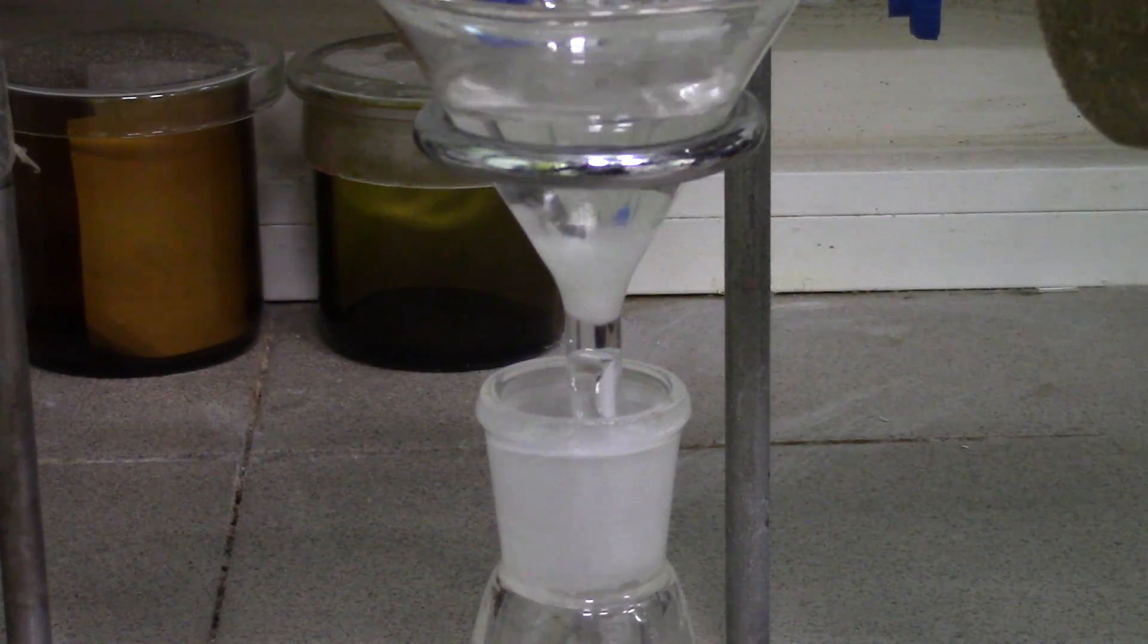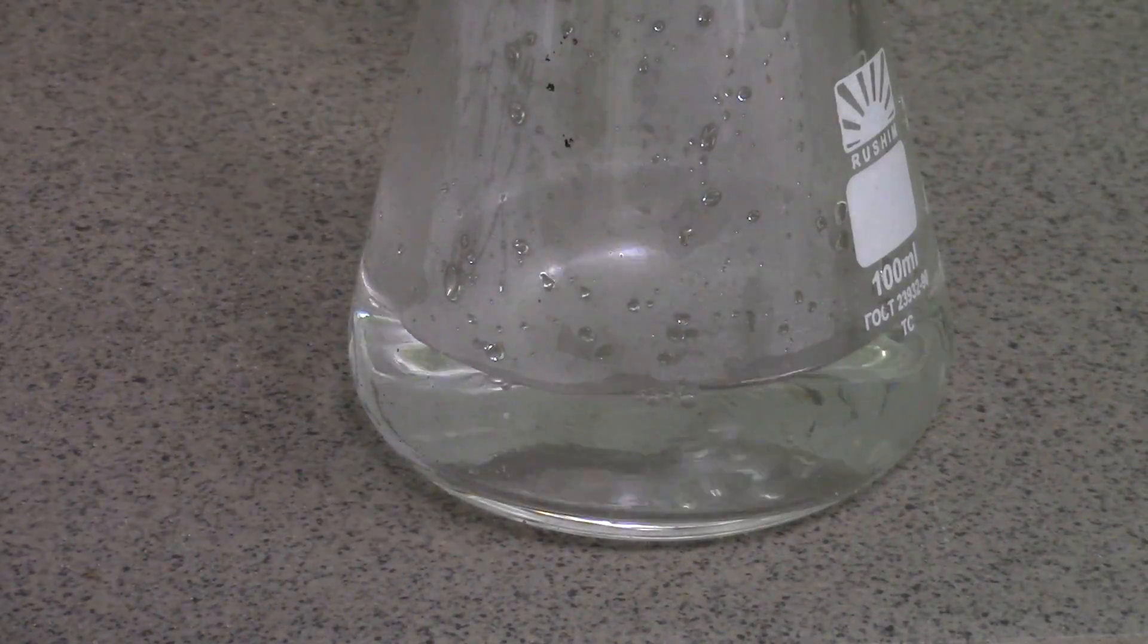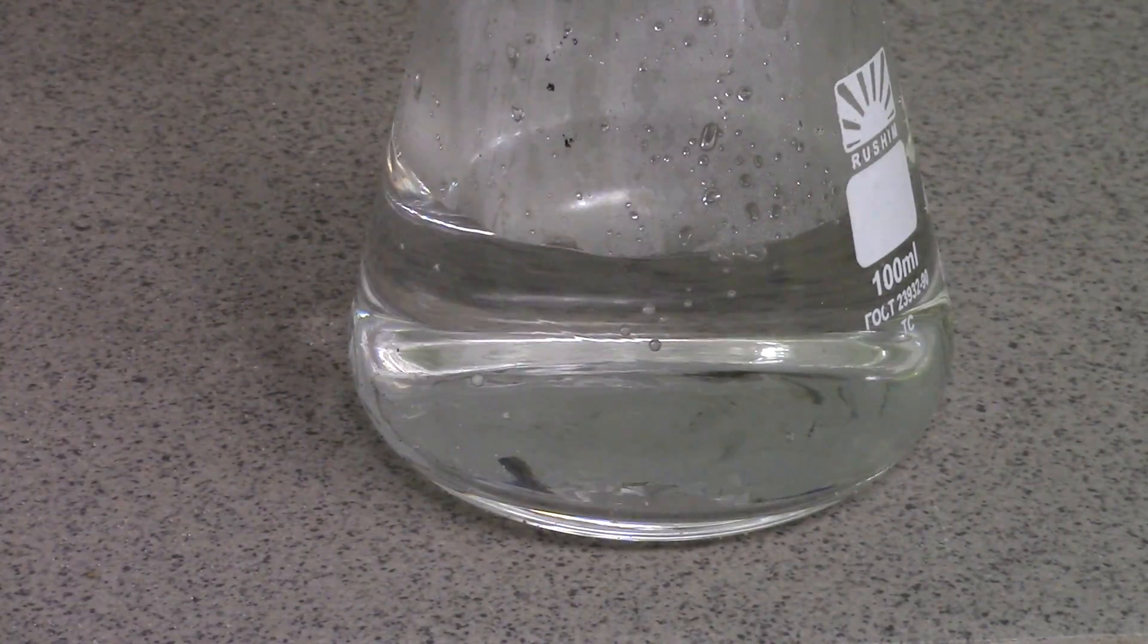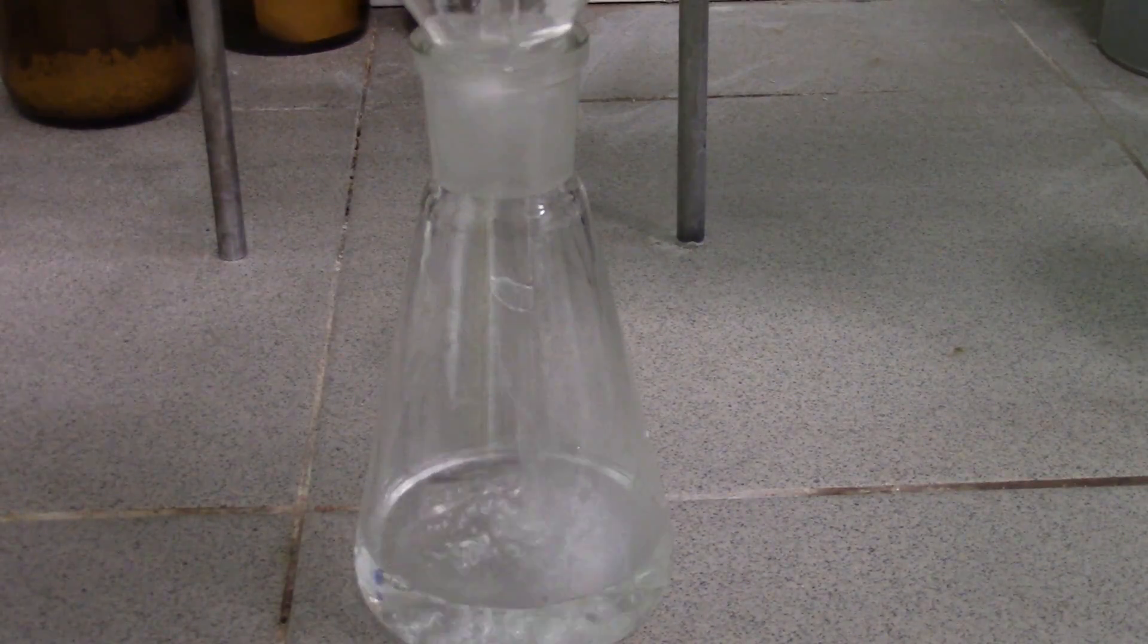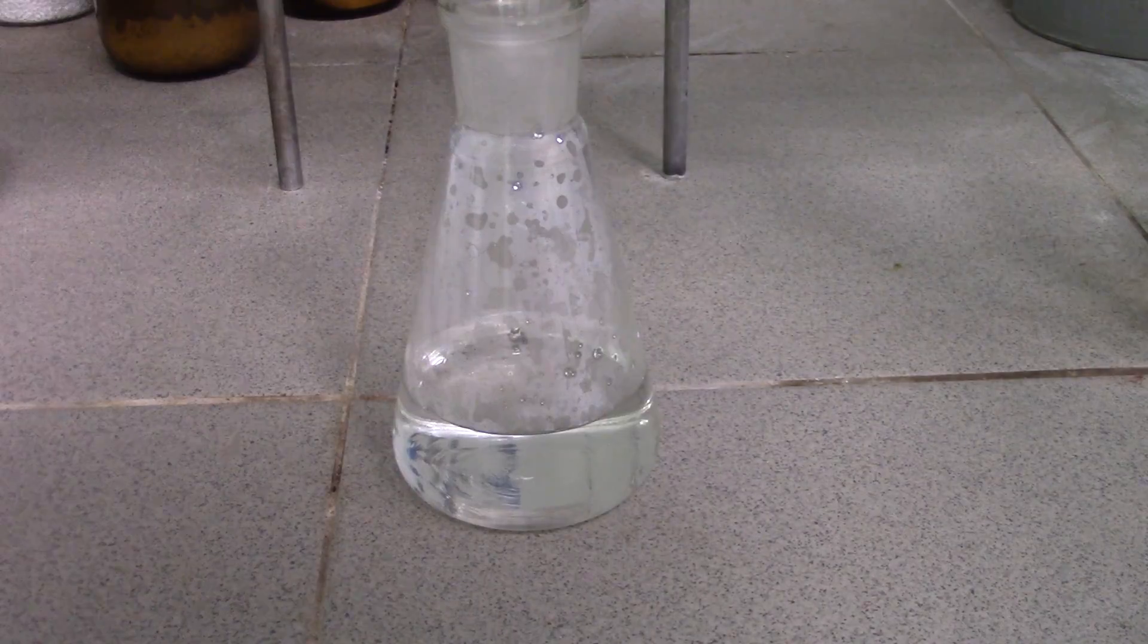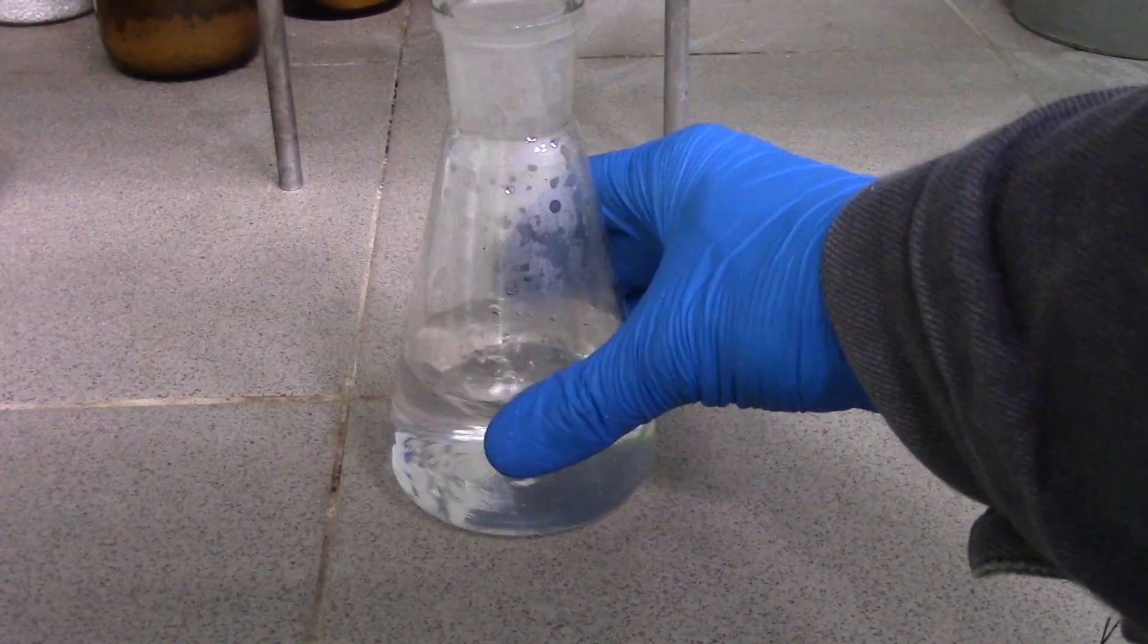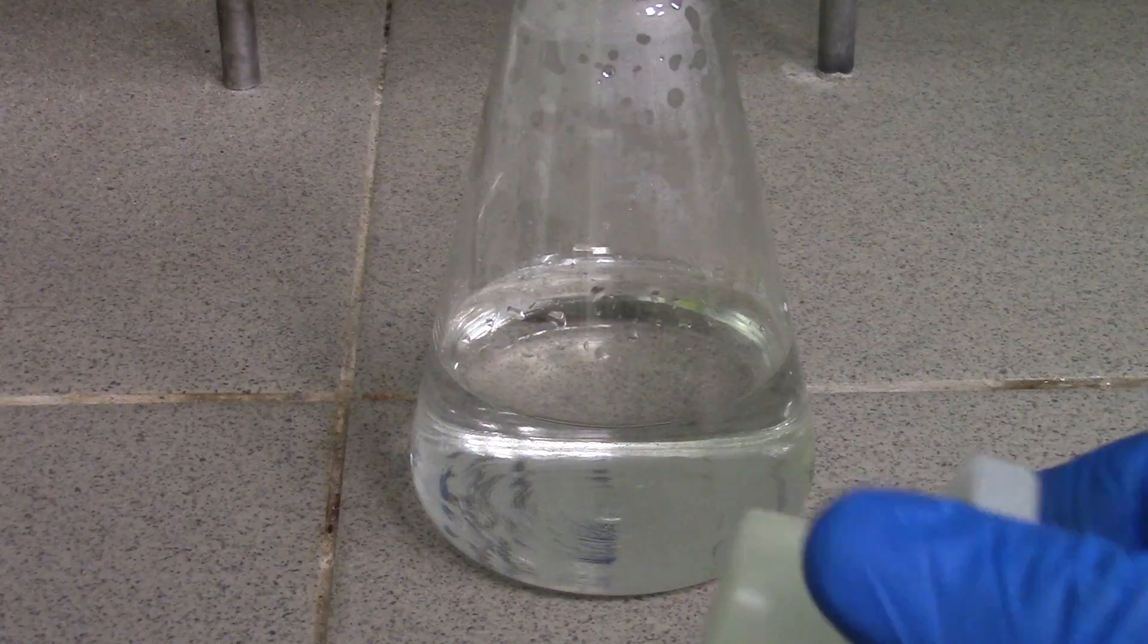So now just filter it off through a cotton ball and add 15ml of ethanol to provide crystallization of pure tetraborate, because it's insoluble in it. Then put the flask into fridge overnight.